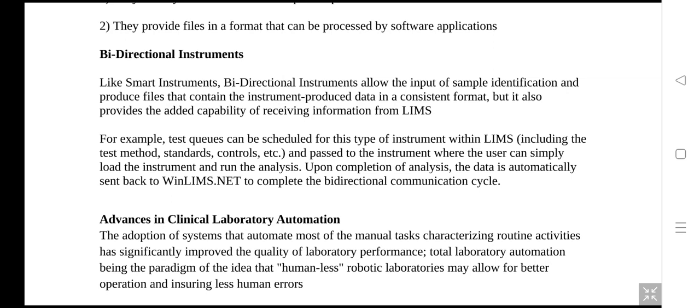Now, for example, if there is a range of values, say 150 to 450, some of the controls our laboratory information system would have should ensure that whatever is submitted to the system is within this range.